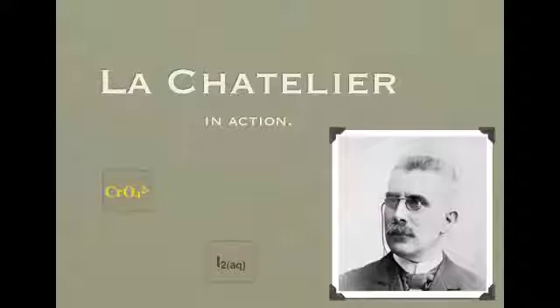All right, Le Chatelier in action. A couple of demonstrations for you based around the Le Chatelier principle that reactions try and oppose changes that are made to them. These demonstrations are found in the Heinemann textbook. Obviously it's for VCE chemistry, so we'll get stuck straight into them.